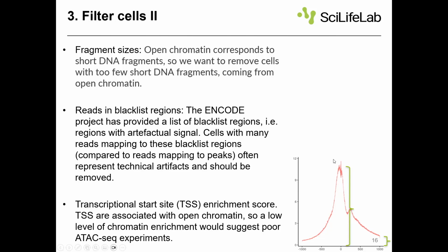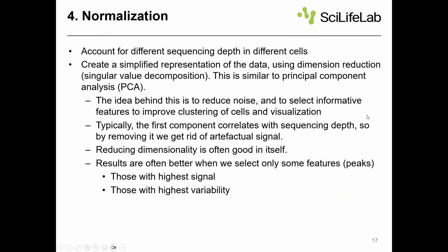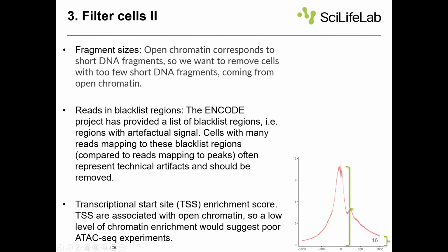And then you also expect to see an enrichment of reads around TSS, transcription start sites. So we basically calculate all this for each cell, and then you have some thresholds on which cells you want to keep and which you want to remove.